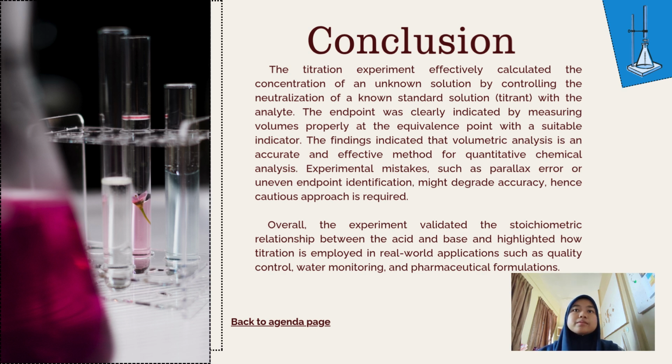Overall, the experiment validated the stoichiometric relationship between the acid and base and highlighted how titration is employed in real-world applications such as quality control, water monitoring, and pharmaceutical formulations.